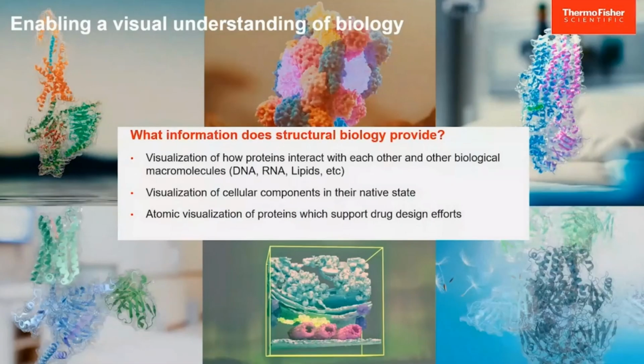And of course, both technologies have led to a very wide understanding of the fundamentals of life, first of all on the visualization of how proteins interact with each other, but also interact with all kinds of other macromolecules: DNA, RNA, lipids. Tomography has given us the possibility to look at cellular components in their native state, being the cell context. And we also see a spin-off with respect to the industrialization of the technology, and that is with respect to the atomic visualization of proteins, which supports drug design efforts.